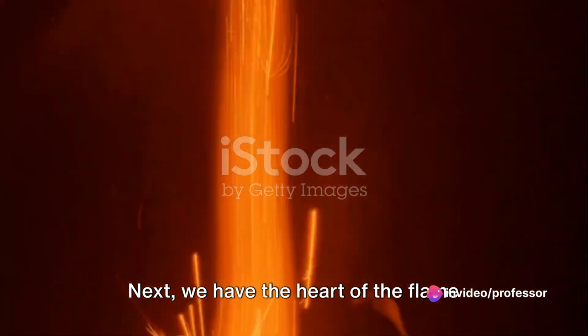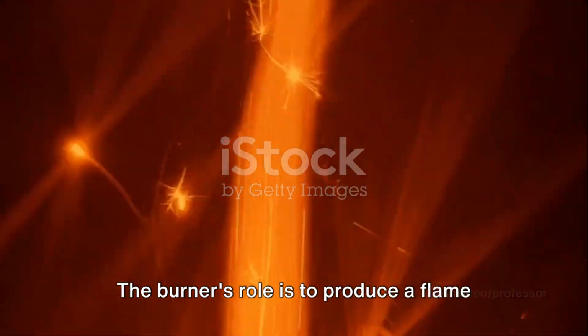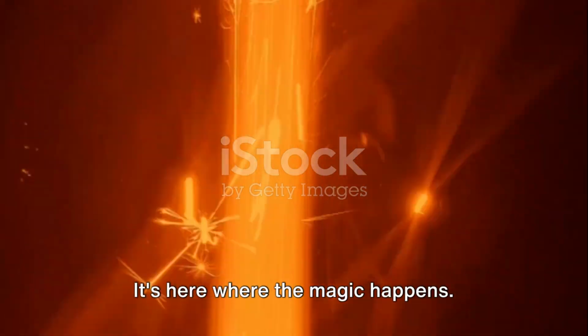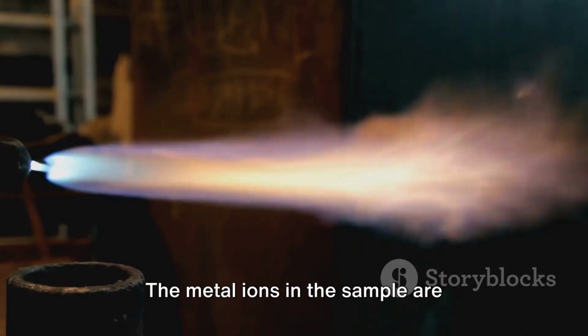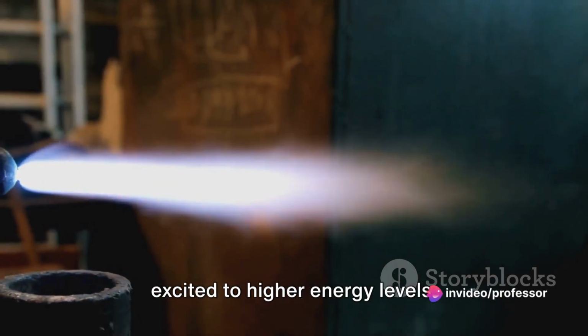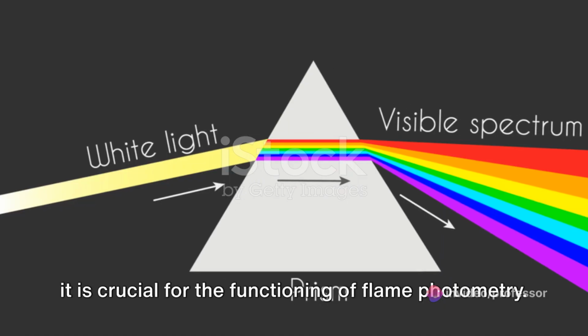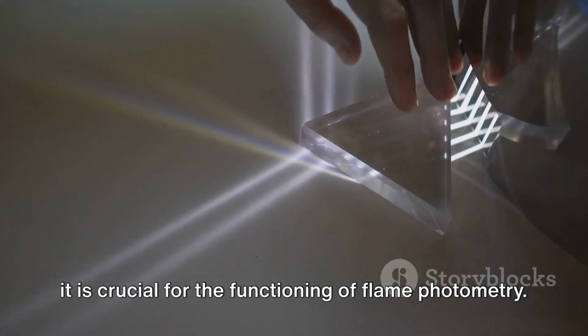Next, we have the heart of the flame photometer, the burner. The burner's role is to produce a flame at a constant temperature. It's here where the magic happens. The metal ions in the sample are converted into gaseous atoms and then excited to higher energy levels. This process is known as atomization, and it is crucial for the functioning of flame photometry.